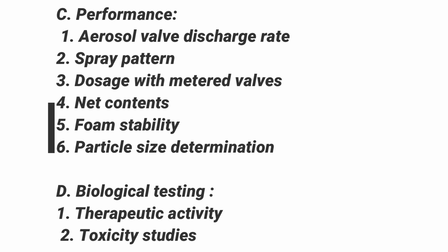The second test is spray pattern. The method is based on the impingement of spray on a piece of paper that has been treated with a dye-talc mixture. The particles that strike the paper cause the dye to go into solution and to be absorbed onto the paper, giving a record of the spray for comparison purposes.